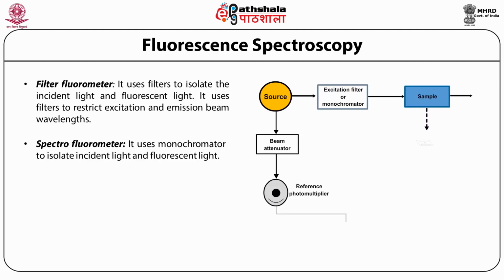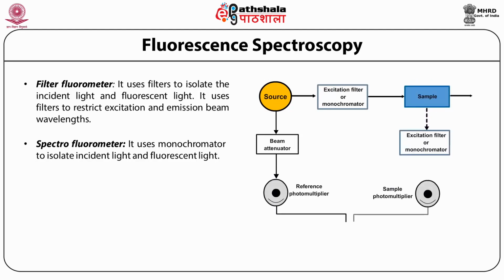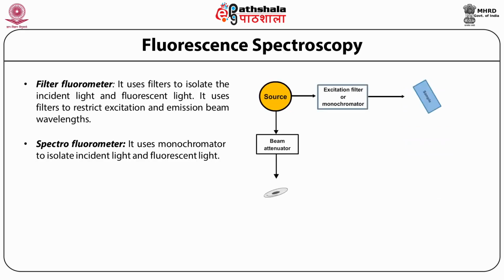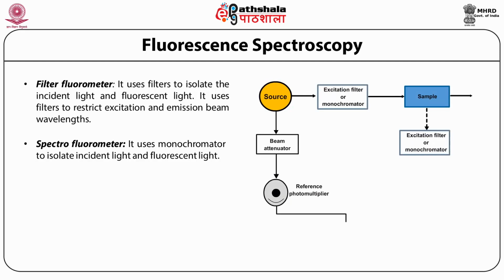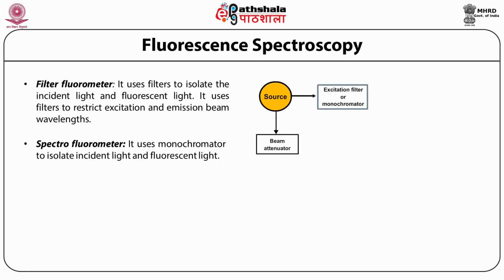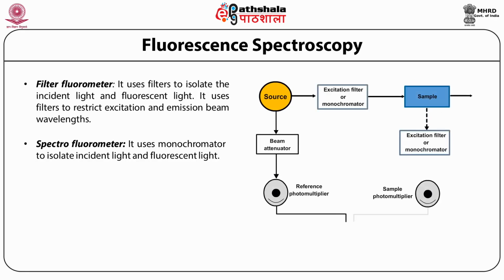A fluorometer provides relative measurement and can be calibrated with a known concentration standard or correlated to standard laboratory models to produce quantitative measurements. Accordingly, based on the technique for measuring the fluorescence, the instruments can be classified into two categories.